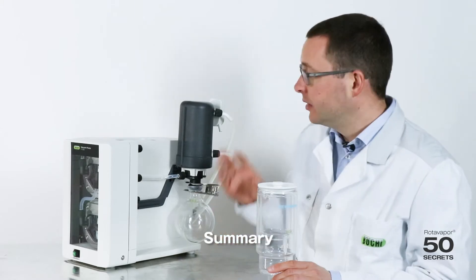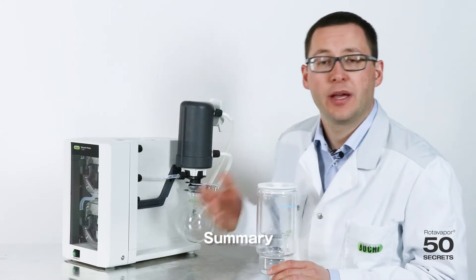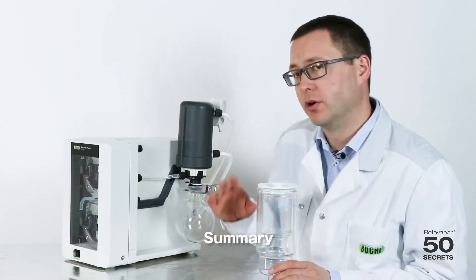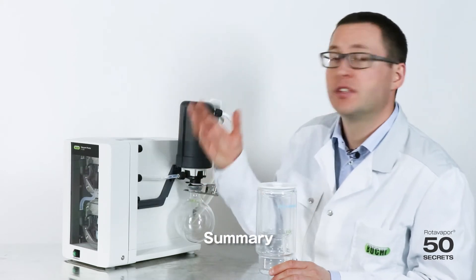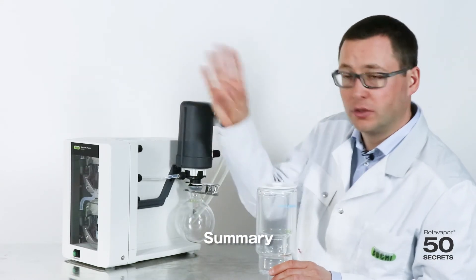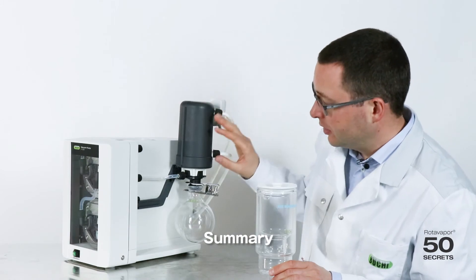In summary, the secondary condenser is especially well suited for customers who are not so experienced and have still a lot of vapor after condensation in the rotary evaporator.